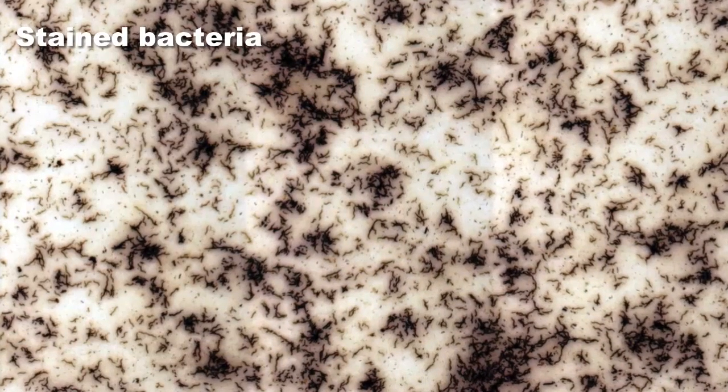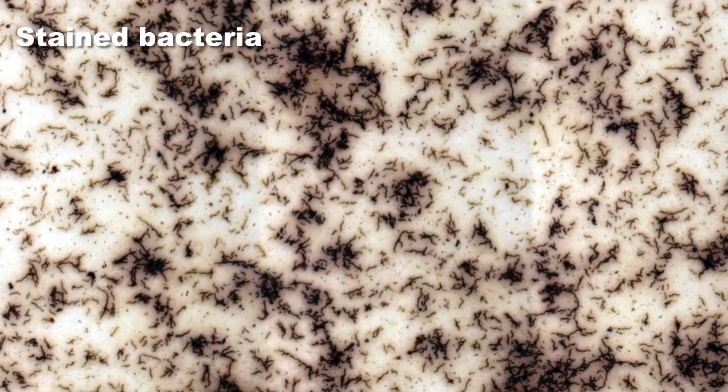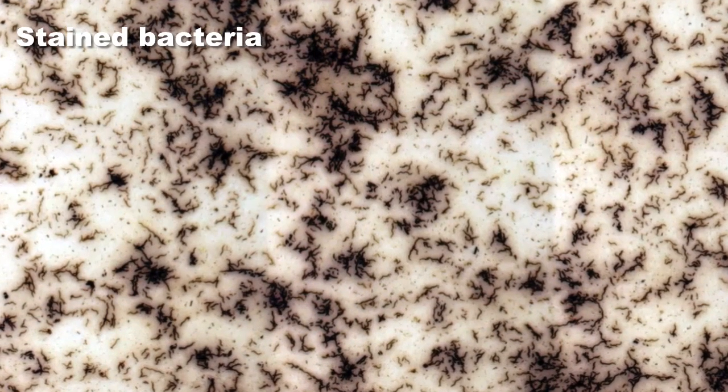So if you want to see bacteria really well, you need a magnification more than 100x. And ideally, you also need to either stain the bacteria. Usually you use methylene blue, or there are also other stains available, or you use so-called optical staining techniques. Now optical staining techniques is an optical way of increasing the contrast.